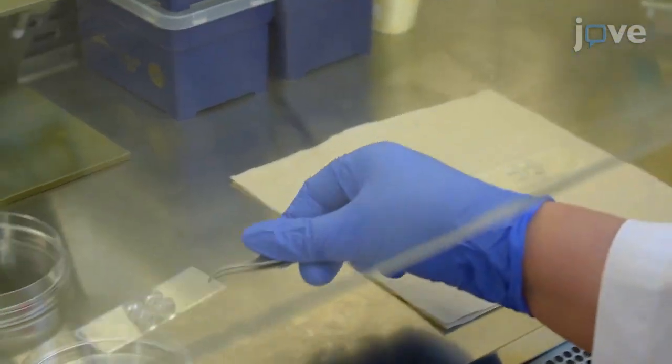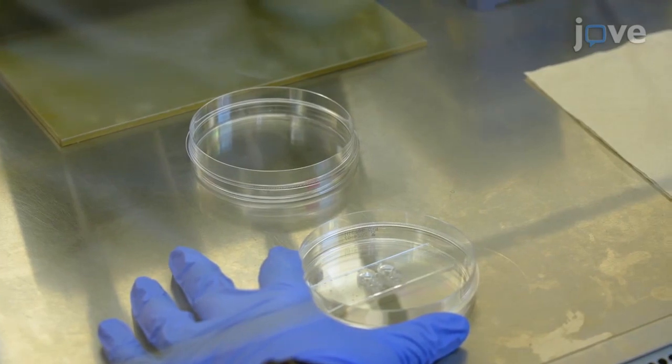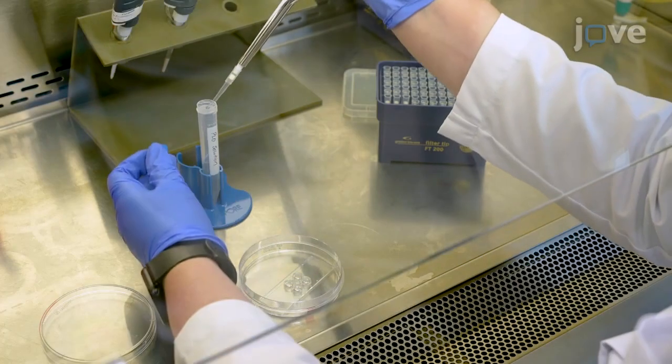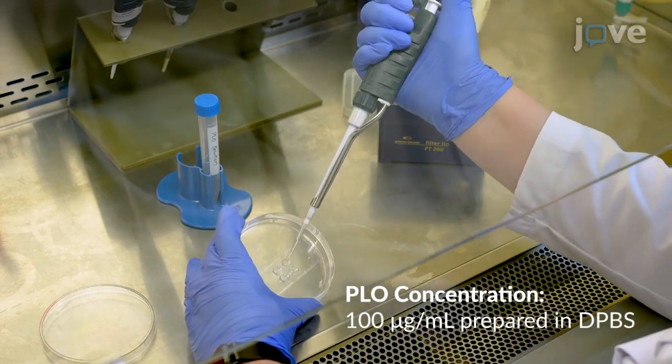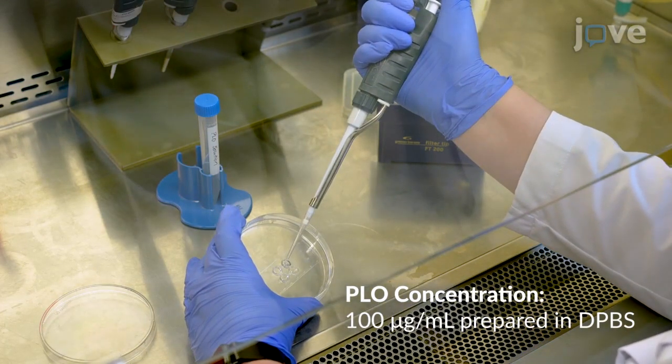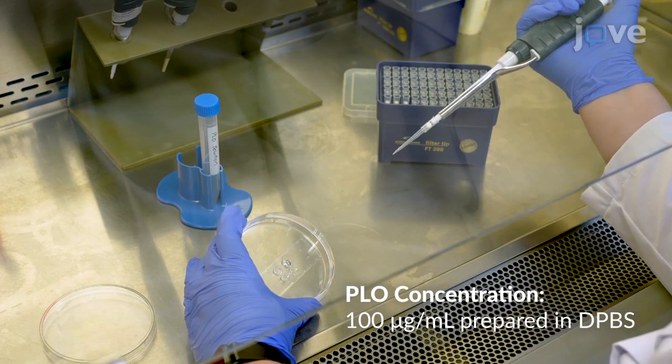Once the device is dried, use forceps to move each device to an individual 10 centimeter petri dish. To coat the device with poly-L ornithine, or PLO, add 100 microliters of PLO solution to the top well and observe the fluid passing from the top well through the channel to the bottom well.